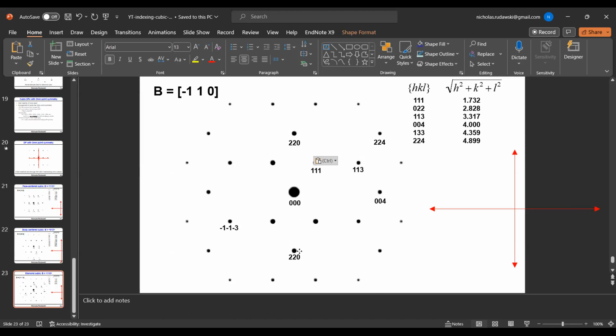And yes, again, I maintain that this is the most technologically important and studied zone axis ever by TEM, the 110 family for silicon. If you do any work with the physical sciences, you will encounter this zone axis at some point in your career, I assure you. And I encounter this basically, if not every day, probably every week in some capacity.